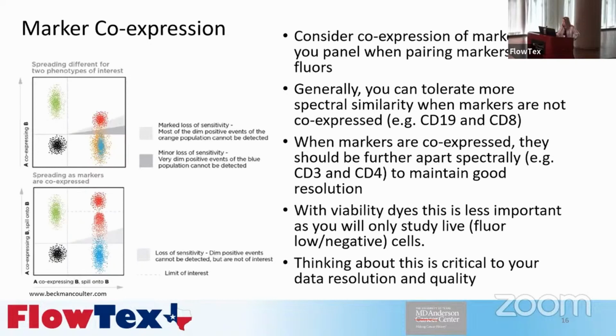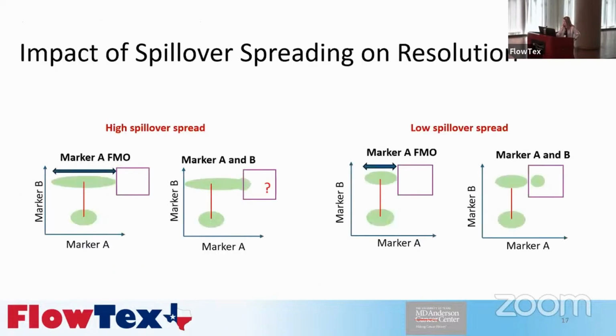So I usually like to pick a viability dye at the low end of the instrument. I'm going to pick something in a UV 450 in order to exploit a channel that is maybe not that easily used and is going to spread throughout the panel toward the red.